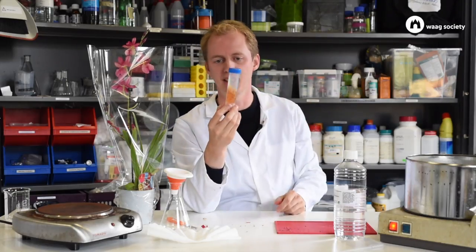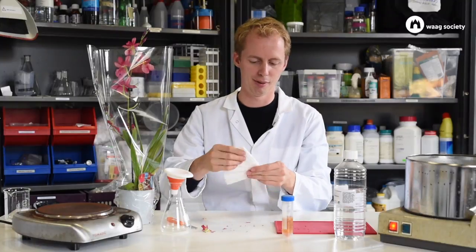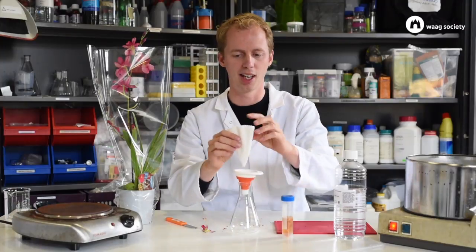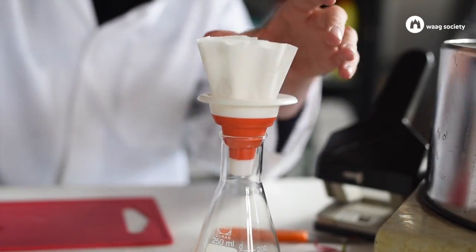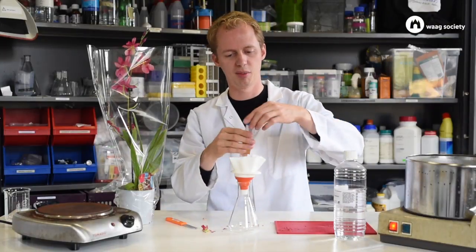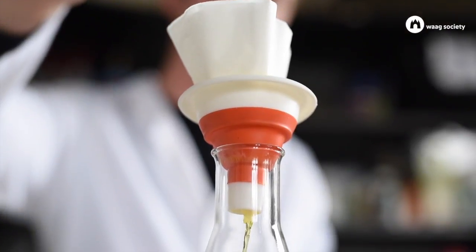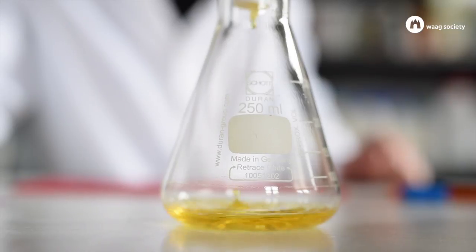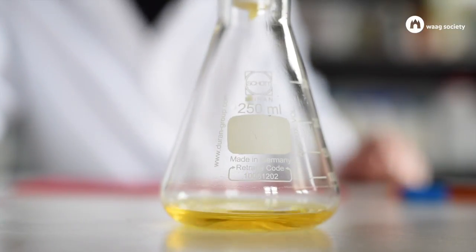Many of the compounds are now in the liquid, but of course you want to get rid of all the small parts of the leaves. For that we'll use a coffee filter. You can fold it a couple of times so that it fits well into a funnel on top of an Erlenmeyer flask. Just put the filter in there and pour the liquid into the filter. You can see there's a clear yellow liquid coming out — this is the alcohol full of the compounds of the plant.